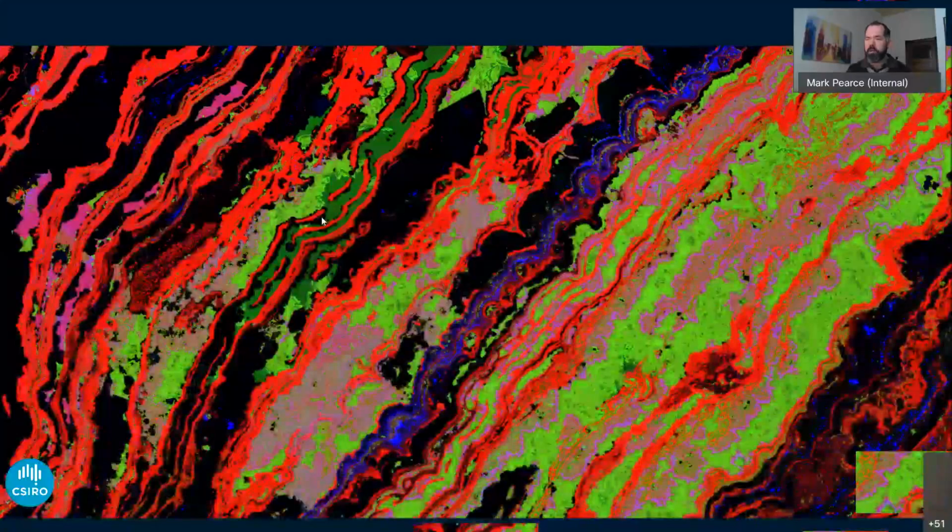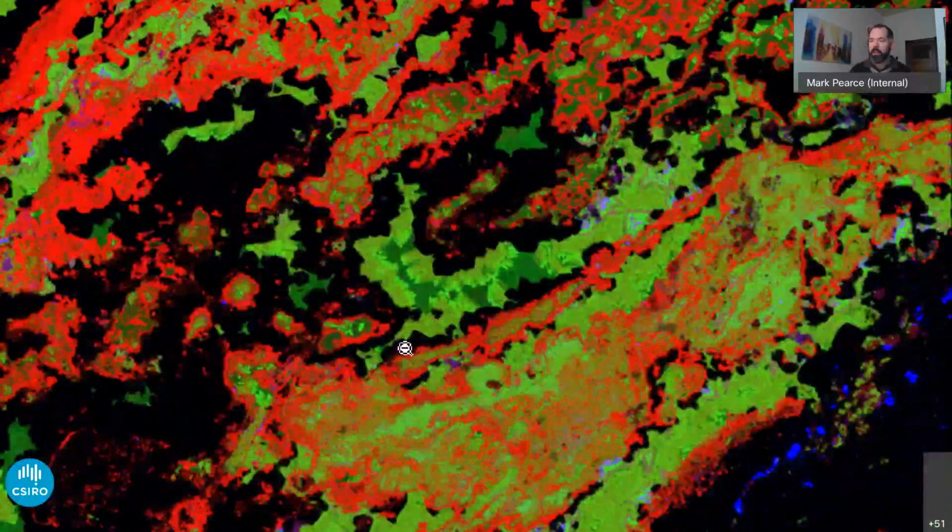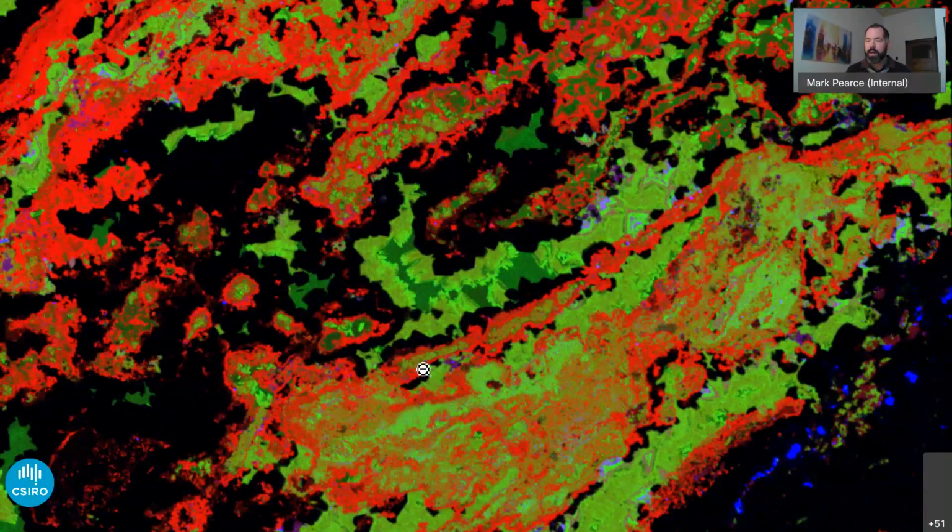One final part of this image shows that in a bit more detail, that we have this process going on throughout this length of core. Again, we've got the euhedral quartz overgrown by various carbonates. So the history of this rock is a lot more complex than simply a banded exhalative sequence.